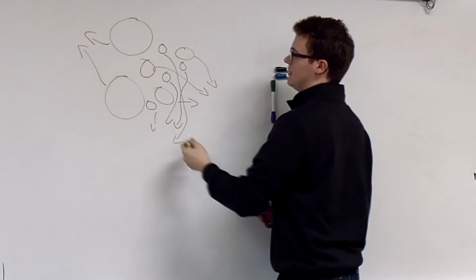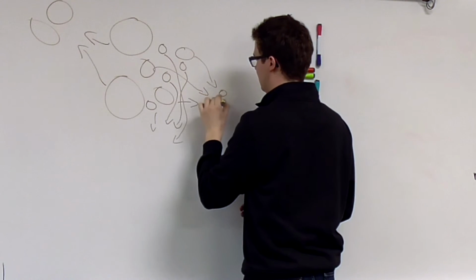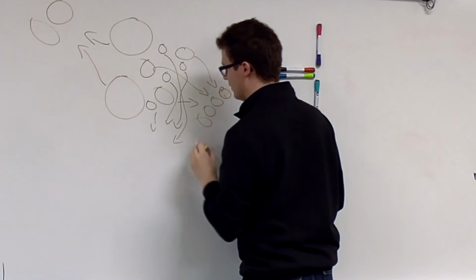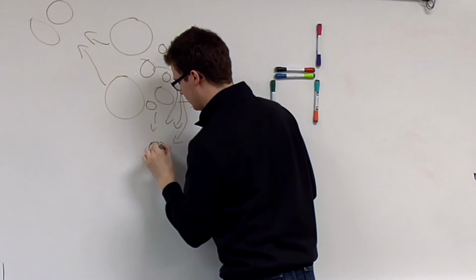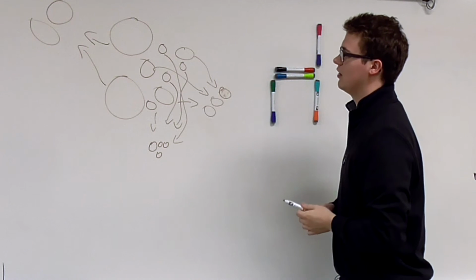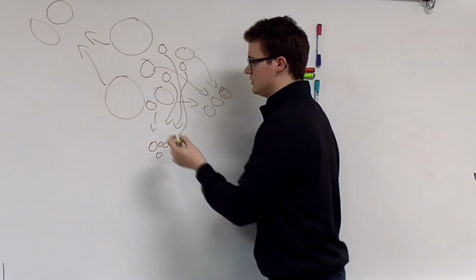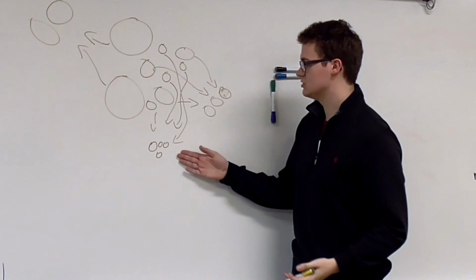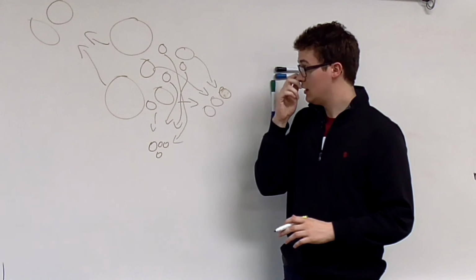And so now what you'd end up with is the two big ones over here, then medium, medium, medium. How many do we have? 3. And then over here, you have your 4 small ones, right? So a good question to ask is, what would the purpose of that be? Again, it would be using the molecules that you're searching for in your solution rather than having all of these come in when you're only looking for specific ones.